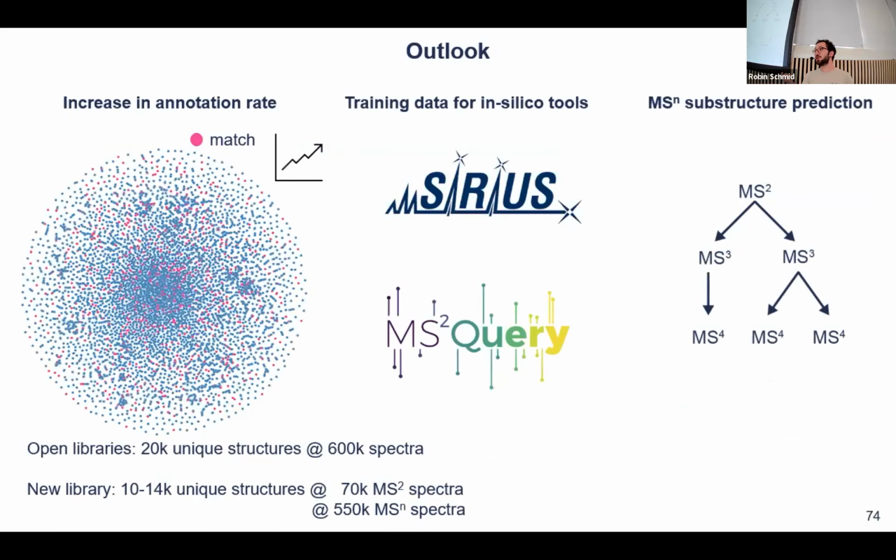And in the future, we think that just working together as a community and really being able to push those spectra very easily is going to be so much of a booster to all the AI, machine learning, and annotation tools that are being developed. Because right now, we don't really know where the spectra come from.